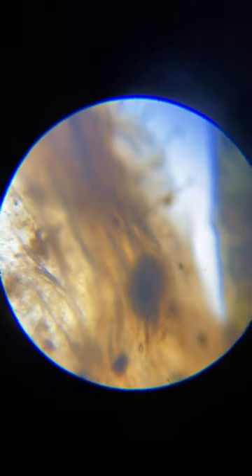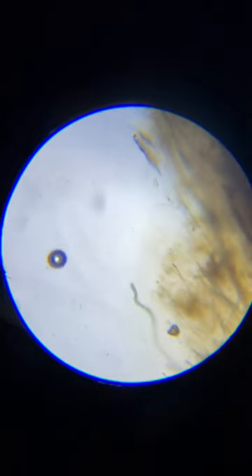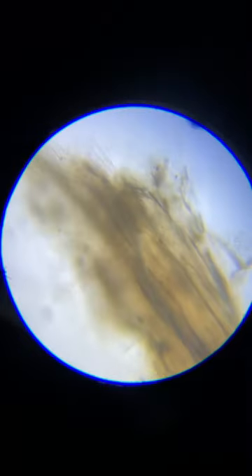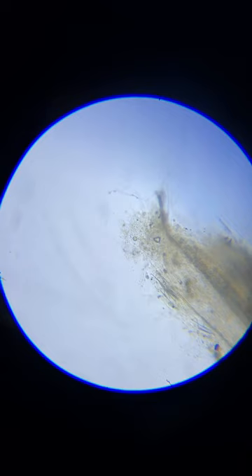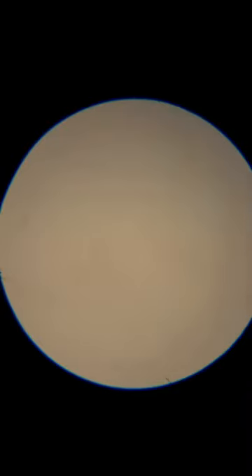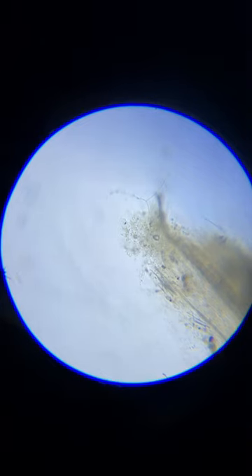I'm going to go out to the very tip and see if I can go 400x — the tip of this fungi — without burying my objective. That's not going to work. I would have to break this off of the mushroom cap to get any closer, so I'll do it right here.